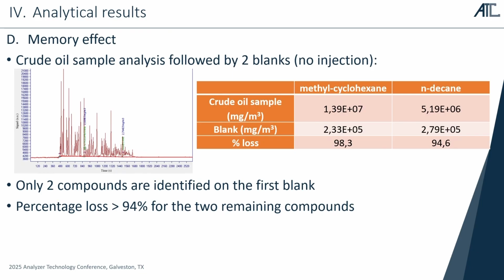So then, crude oil is a kind of dirty or complex sample. One of the challenges is not only the analytical performance, but if we move from one sample to another, how to be sure we have no memory effect, no contamination from the previous sample. And that's part of the design of the system: to clean every cycle the liquid injection system and the pre-column and the column to ensure there is no residue.